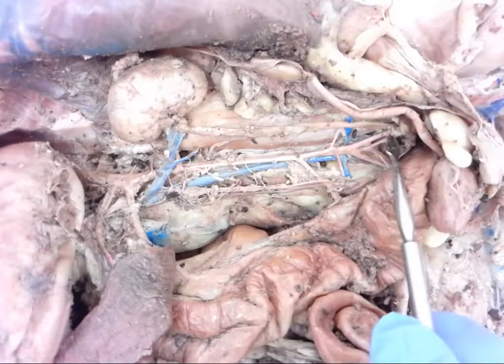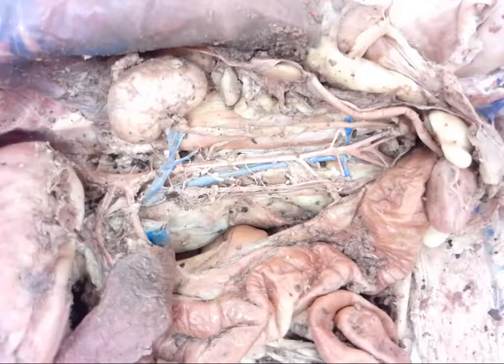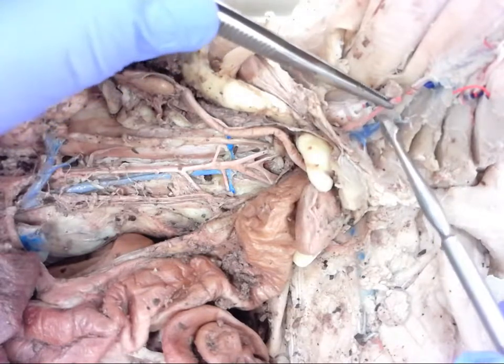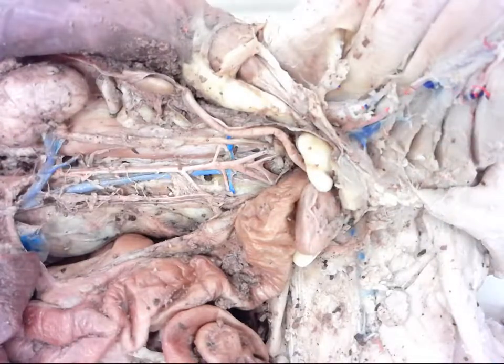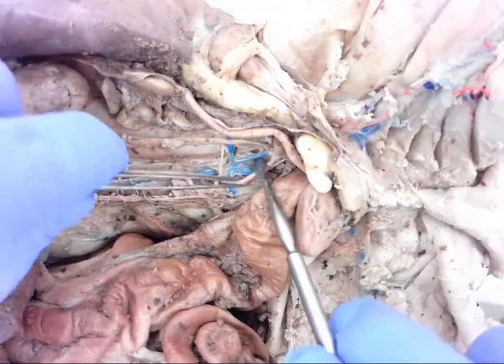All right. If we continue those further down, they actually are going to go down the leg. In this specimen, they have been cut, but you can see, right down here, the remaining parts of them. So there is the femoral artery and the femoral vein that run down the leg and supply the leg with blood flow. As the blood comes back, it will come back through the femoral vein. It will come back through here. You have your external iliac.